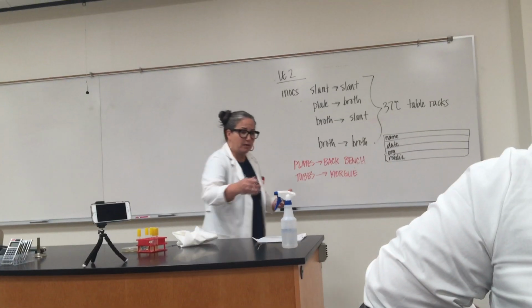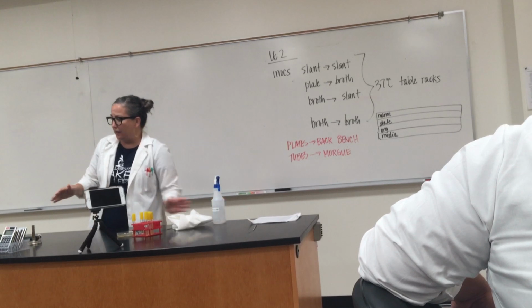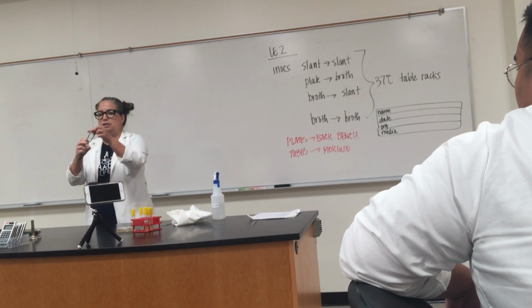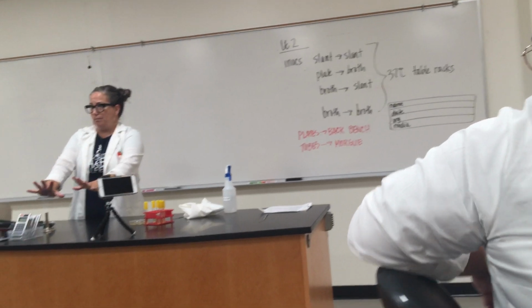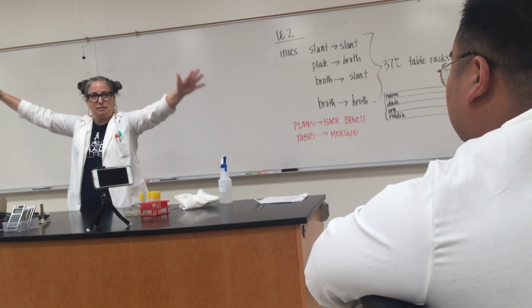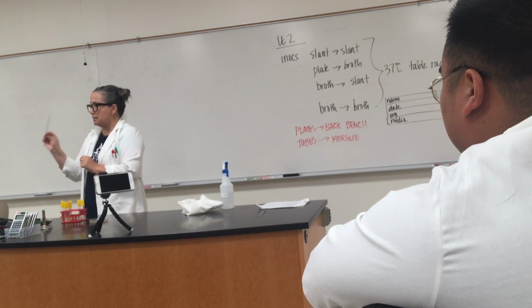The first step in that parade is cleaning off your countertop, right? So we're going to spray the countertop, we wipe the countertop down, and then we work in an area with a Bunsen burner, right? So we light our Bunsen burner. If it doesn't spark, let me know because we can actually change that little flint that's inside there, right? I want to work near the flame because flame makes heat and heat rises. And all of the animalcules will hit the hot air and go like this and go away. So we work here near the flame of the Bunsen burner.